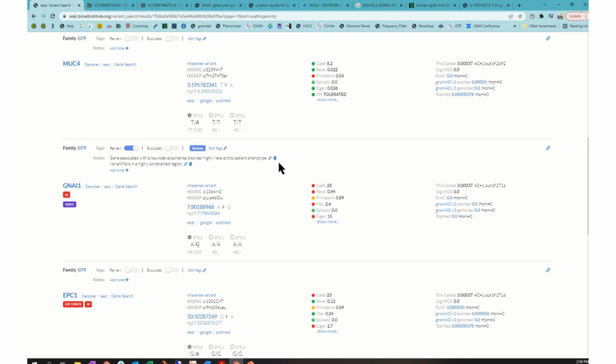One additional feature that's actually enabled in this training project is that seqr facilitates submissions to Matchmaker Exchange for any genes where you are interested in a potential variant, for example, a rare de novo change that looks damaging, but the gene has no existing disease association. You might want to submit that to Matchmaker Exchange, and seqr actually greatly facilitates that.